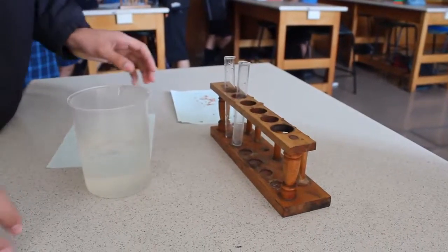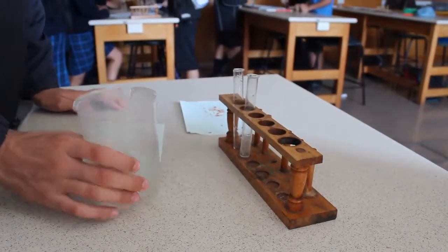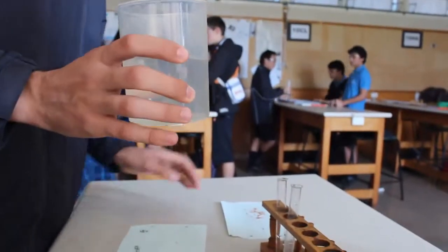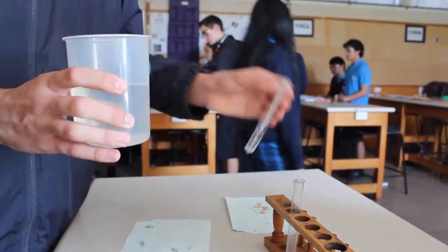Okay, we're now doing an experiment on catalysts. We've got some dilute sulfuric acid and we're going to put about two centimeters in each test tube.